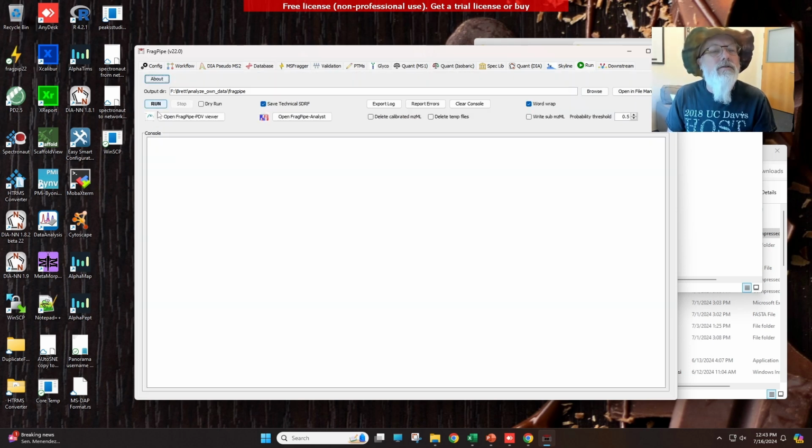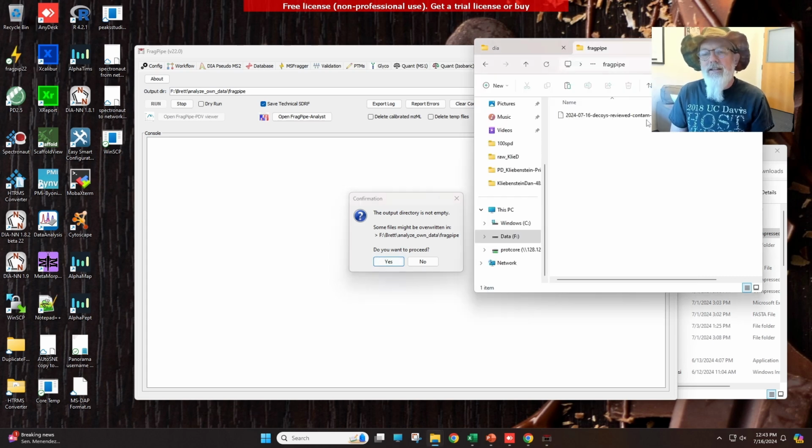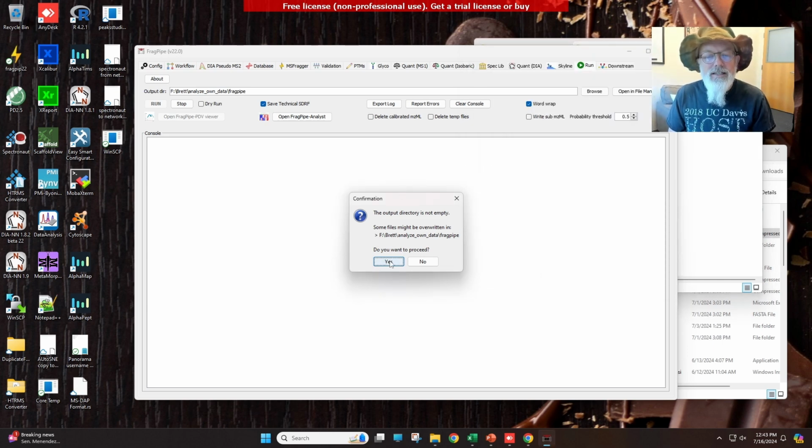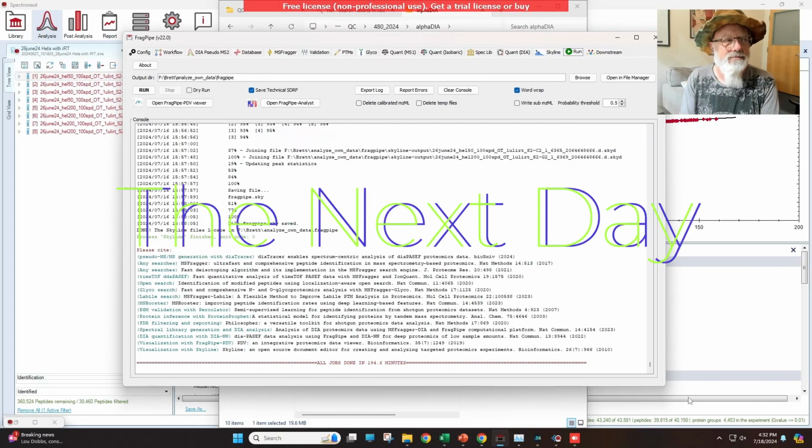Then I hit run, and it gives a warning that there are files in the folder. But the only file is the FASTA file, which FragPipe lists as an FAS file, but it's the exact same thing. Do you want to proceed? Yes. All right, I'll see you in about 2 hours, which will be like 2 seconds for you. Okay, is that working? I think it's working.